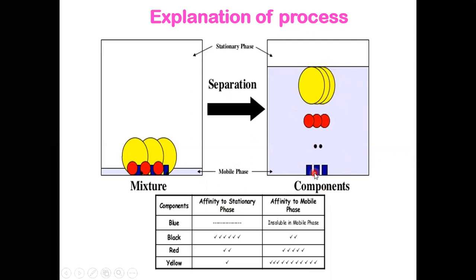In TLC, the mobile phase always acts as the carrier, and the whole retention mechanism depends on the interaction of the solute with the stationary phase.